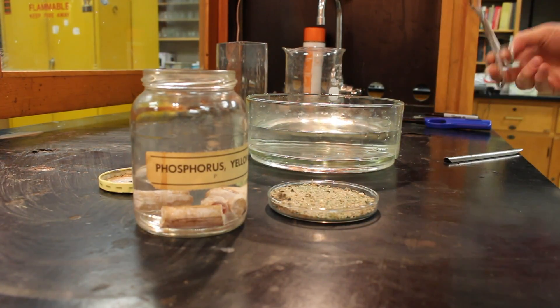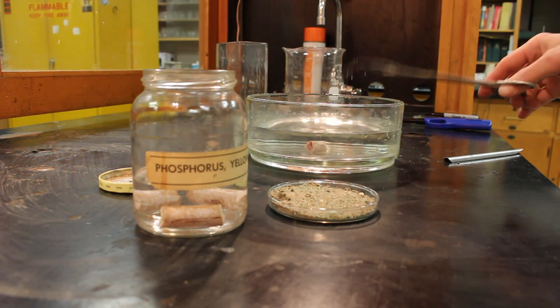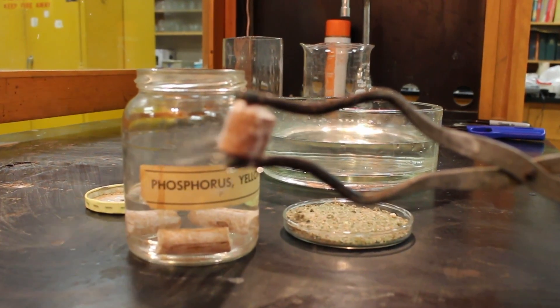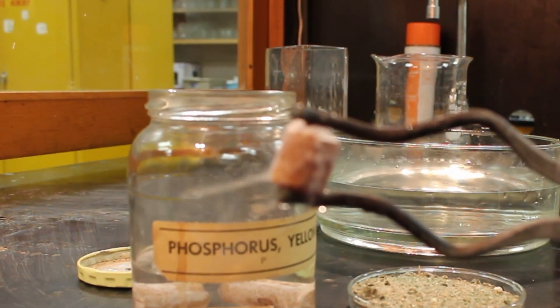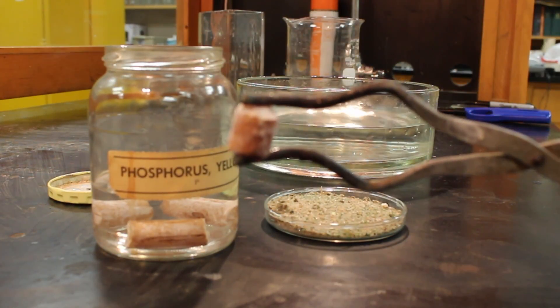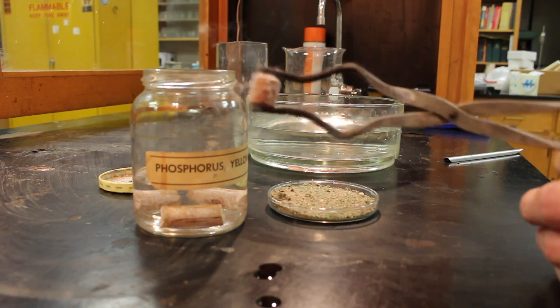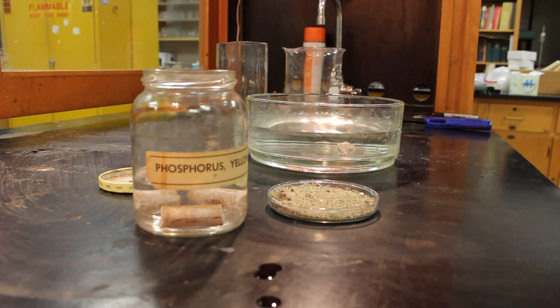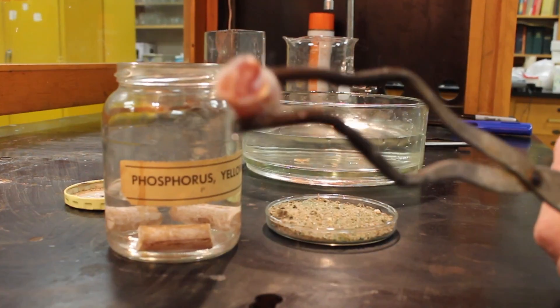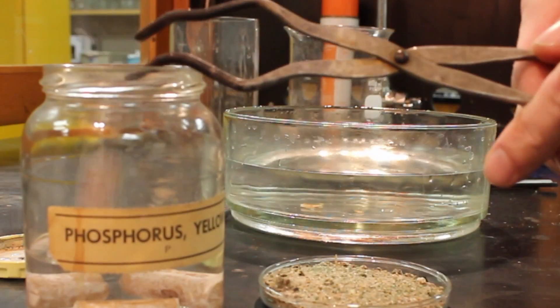Let me pull a chunk of phosphorus and put it in this big container of water over here. Something really interesting — let me pull it out for just a second and show you. See the smoke that starts rolling off the phosphorus once it's out of the water? Putting it back in the water causes that to stop. Once it's out in the air and the water evaporates a little bit, we see smoke starting — that is phosphorus pentoxide. Smells a lot like matches. I'll put it under water so we can get it cut. You can see where we've cut it — it's a really interesting red color.